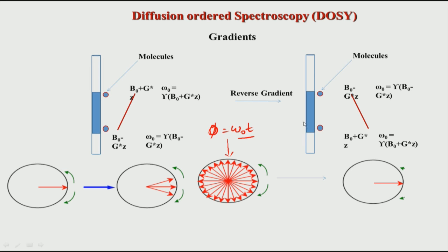But now by applying this gradient, I can undo that by going to the opposite side. So, all these phases will be negative, because you can see here now they are subtracted and here it is added. So, they will go back by the same rotational angle. If something has moved by 50 degrees, it will come back by minus 50 to 0. Similarly, something which has gone by 72 degrees will come back with minus 72 to 0. So, all of them finally come back to the same position, and now they have come back in phase.